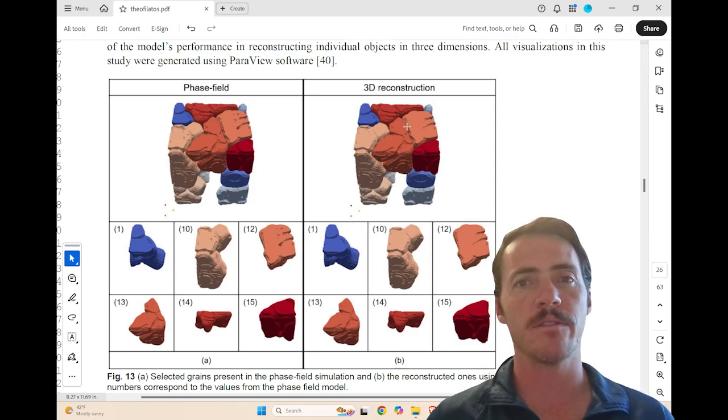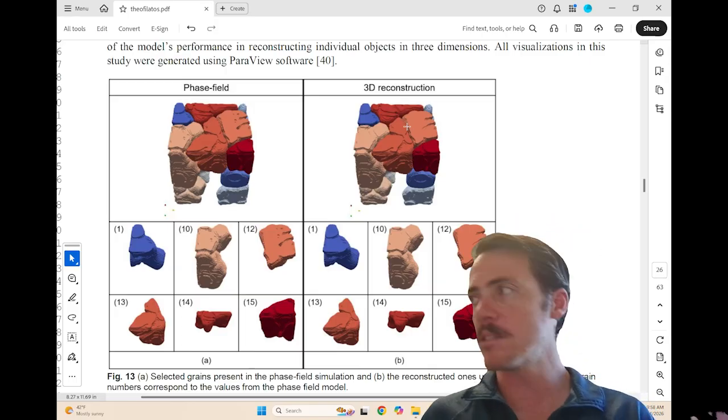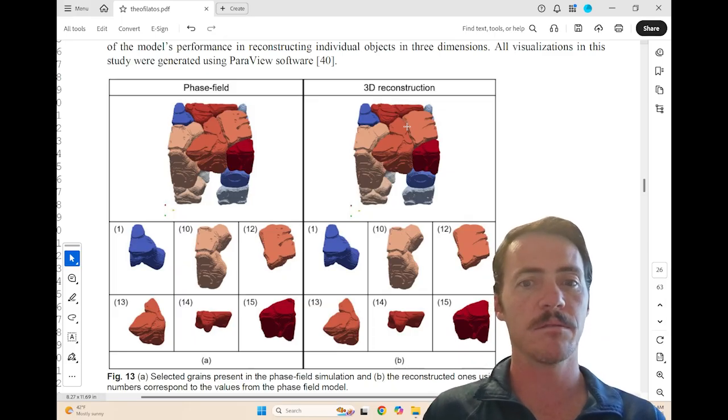And obviously, once you have this, it gives us what material scientists care about. Now we can get things like phase fraction, grain size, or grain misorientation. In other words, it's going to turn images into quantitative data sets, which is pretty cool.